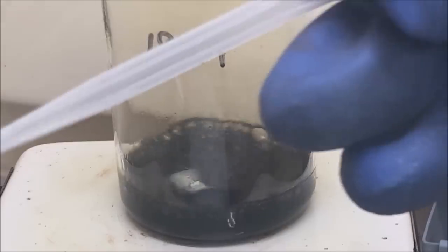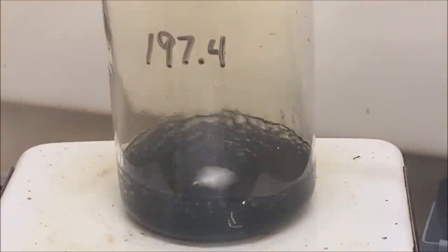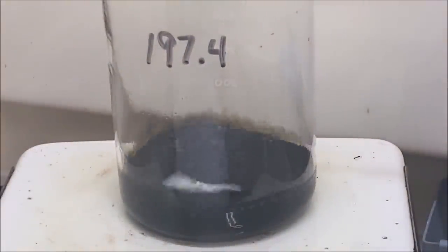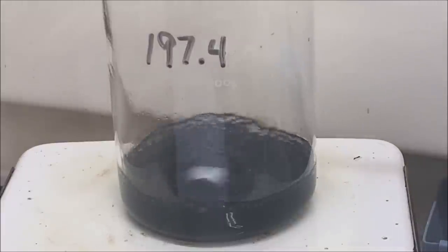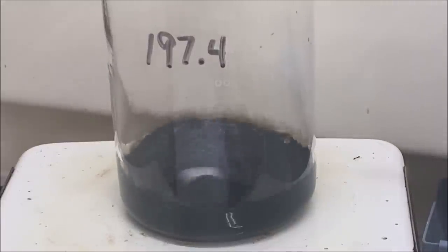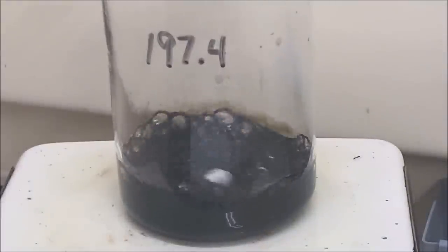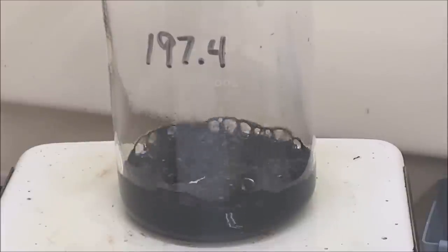You can still see just a touch of brown fumes in that beaker. Now here they're completely gone. I don't see any more brown fumes forming. And I think we've driven off just about all of the excess nitric that we can. I'm going to turn the stir bar now off, take this down off the heat, and let it cool down.